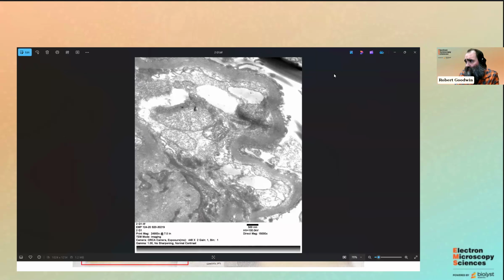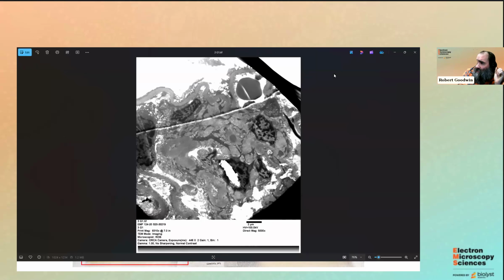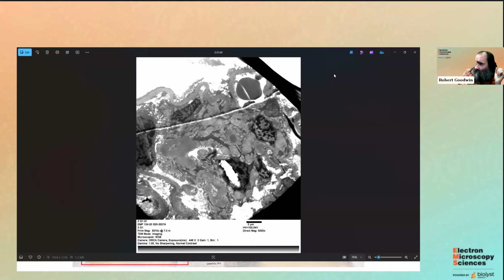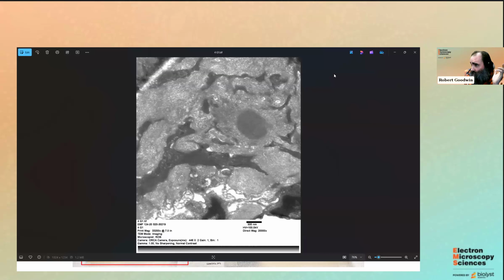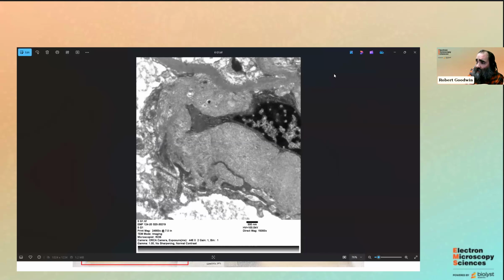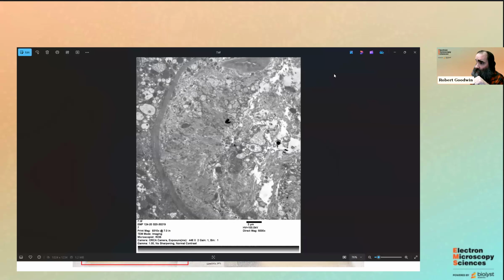So yeah, it's one of these things, it can very well come out a lot different. This wasn't the most pristine sample to begin with, but you can still see comparable contrast. These were taken on our old Hitachi, shortly after we got a new microscope and picked up the processor as well. This was on a microscope that was about as old as I am.